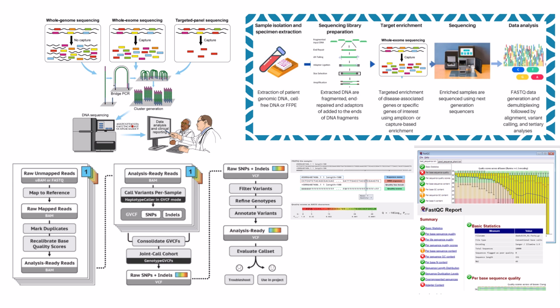That's where trimming and filtering come in. This step is absolutely crucial. You often get lower quality bases at the ends of reads, and sometimes you have leftover bits of technical sequences, adapters that were added during sample prep. Okay. Those need to go. Keeping them would really mess up the next stage, the mapping. So tools like Trim Galore are used to snip off those low-quality ends and remove adapter sequences. Reads that are too short after trimming might get filtered out too. And then, logically, you'd check the quality again after you've cleaned it. You got it.